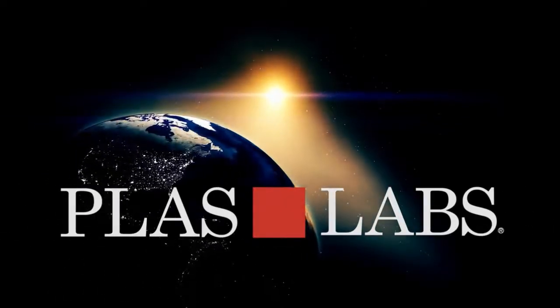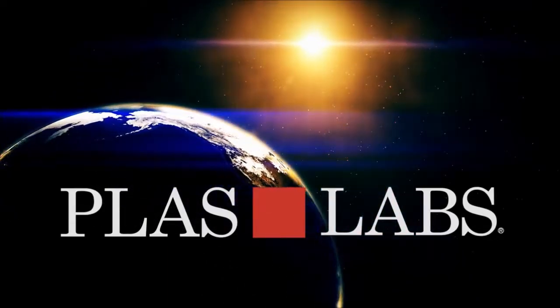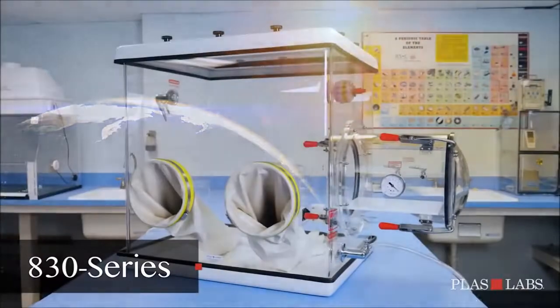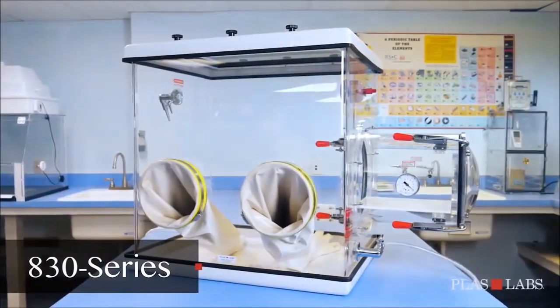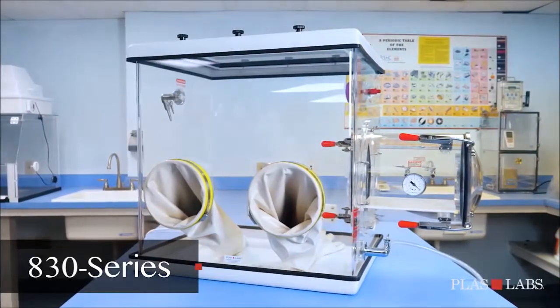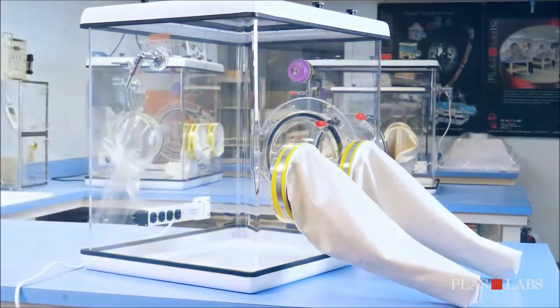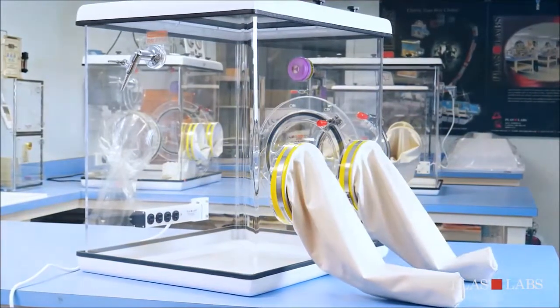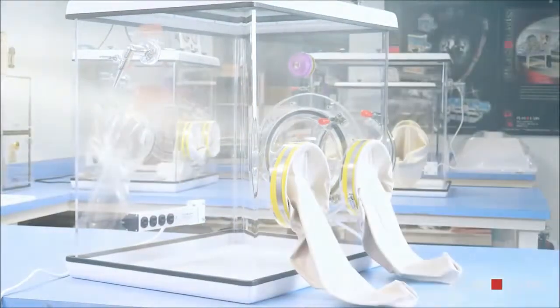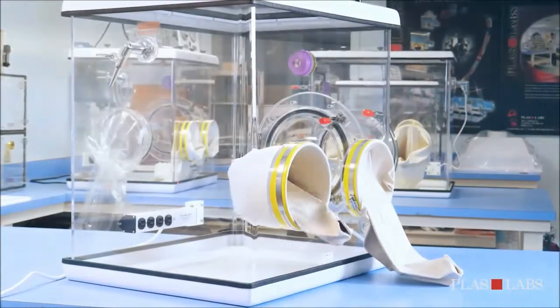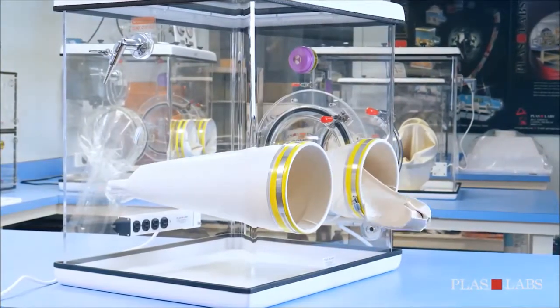Plaslabs, world leaders in acrylic containment and isolation technology. The 830 series compact glove box is a completely sealed glove box for isolation and/or containment. The 830 series has been developed to minimize drafts and maximize the effectiveness of your analytical balance. It can also be used with any inert gas to reduce oxygen and moisture levels inside the glove box.